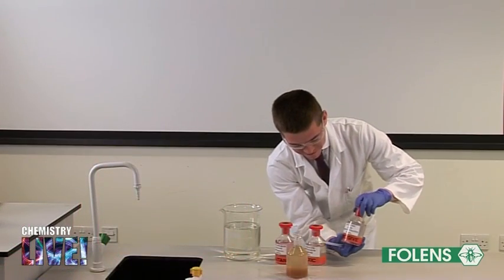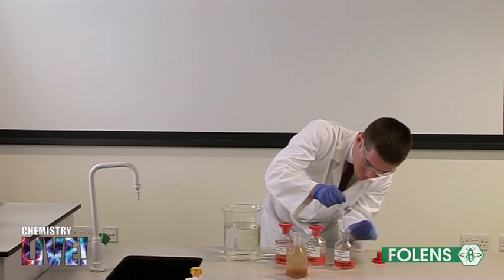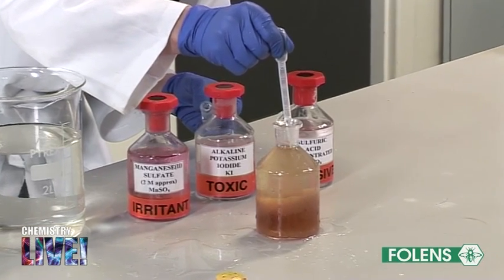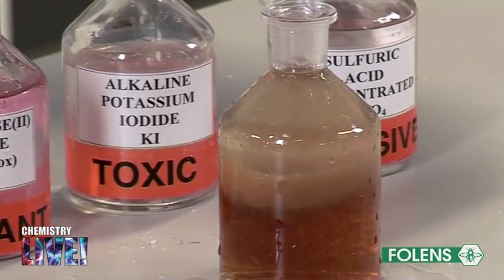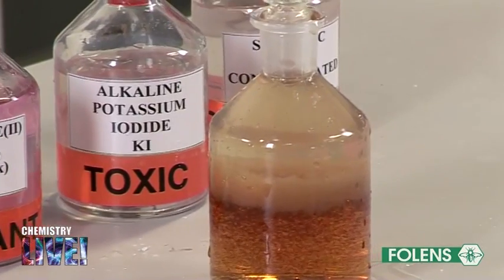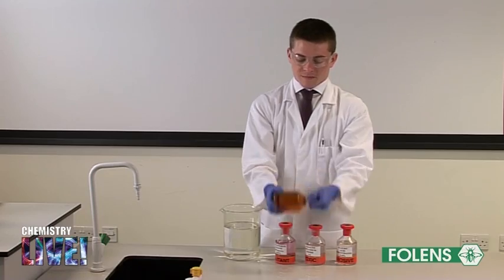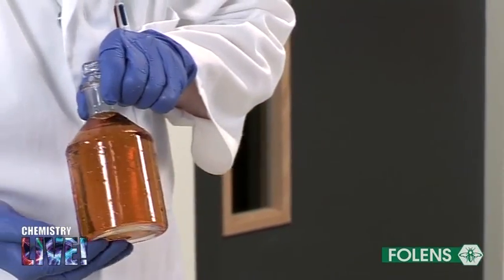Using a graduated dropper, carefully add 1 centimeter cubed of concentrated sulfuric acid to the bottle, allowing the acid to flow down the inside of the glass. Re-stopper the bottle carefully to avoid dissolving any oxygen from the air, then shake the bottle to re-dissolve the precipitate. If the precipitate is difficult to dissolve, add a few more drops of concentrated sulfuric acid.